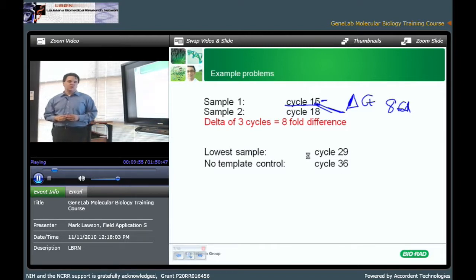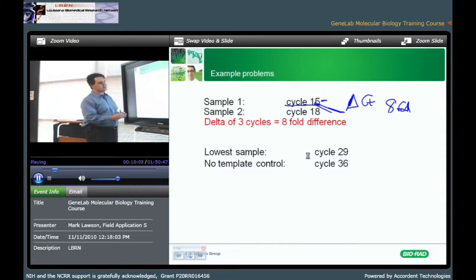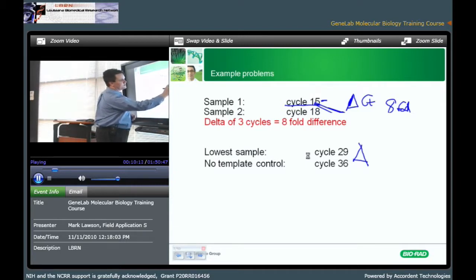With qualitative PCR, with conventional PCR, that would simply be viewed as a failure, right, a problem. With quantitative, with the ability to quantify these amounts, I can actually say that this is a delta CT of 7 cycles.